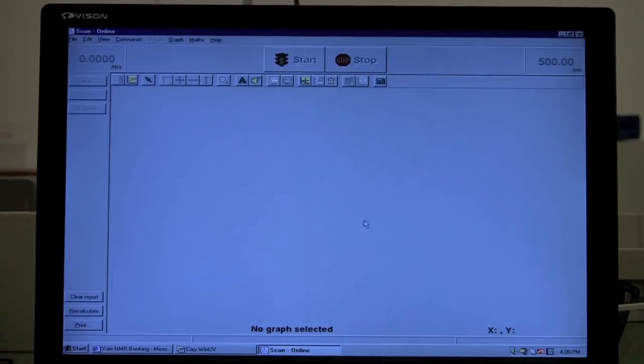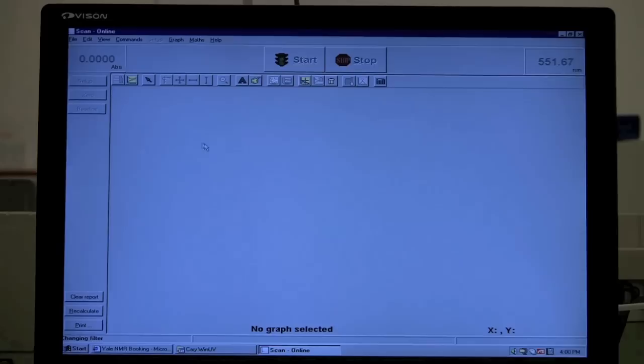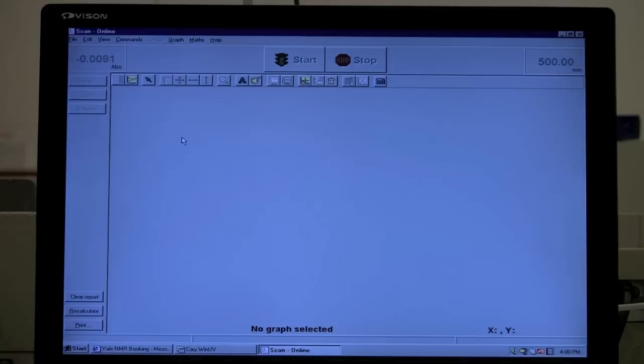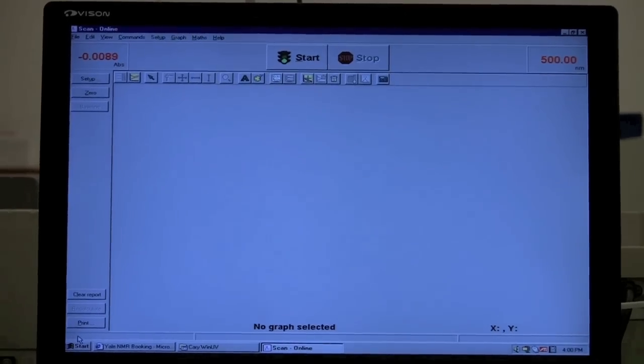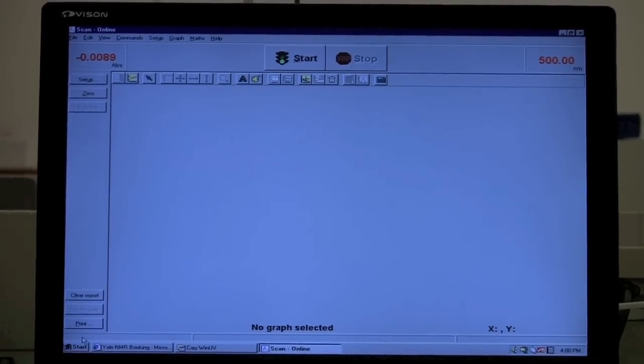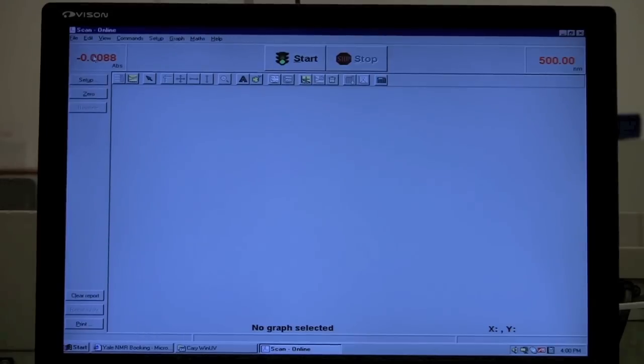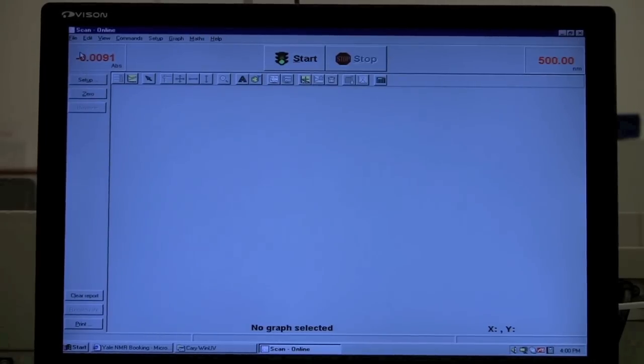So on this one, there's a couple things that you may want to do. We're waiting for it to initialize. You'll see down on the lower hand corner here if it's initializing. And then these will turn red if it's ready to go.